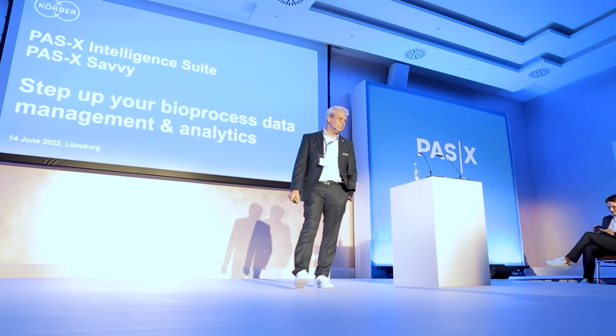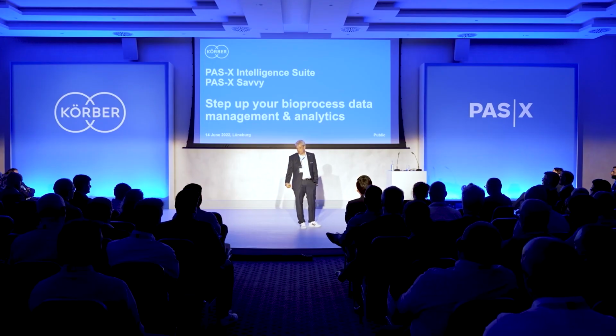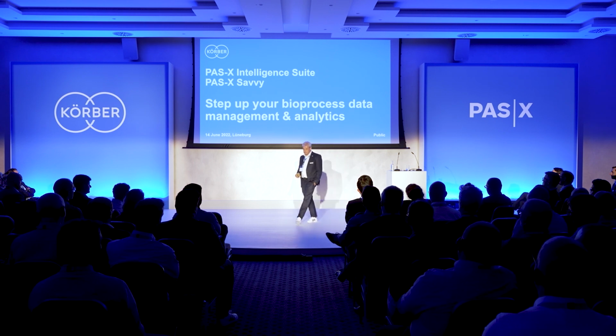I start the session with this bottle. It's not for me to drink. What could that be? Could be a bottle of purified protein, right? How much is that worth? About 2 million euro? Something like this could be, right? Or even more. One shot of Kymriah costs 400,000. What if the quality is not correct?